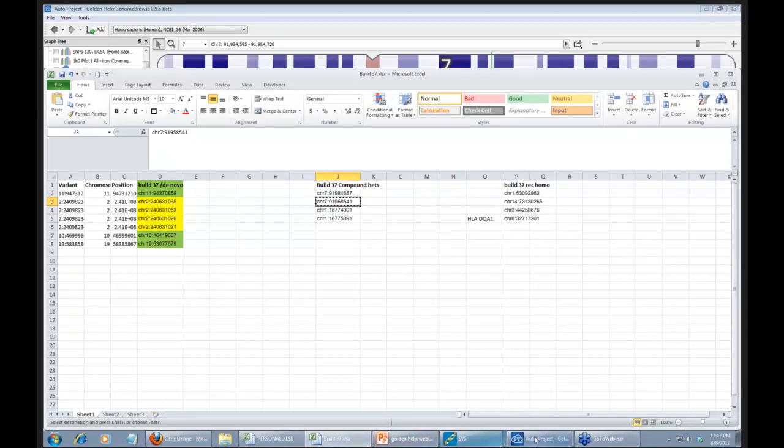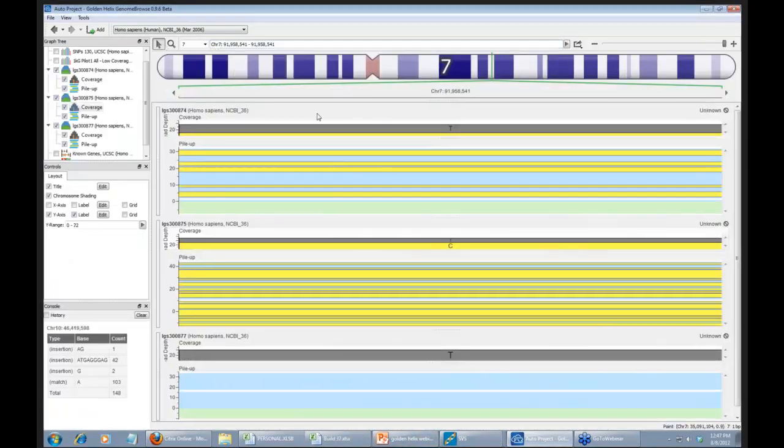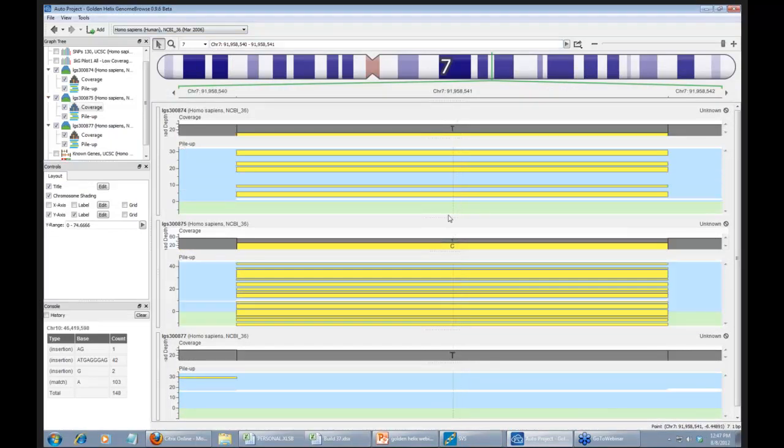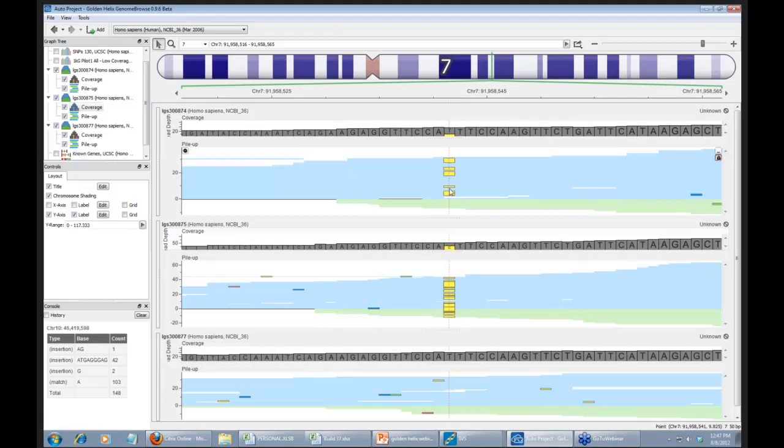If we look at the other polymorphism in this gene, we can see it fits the model that we've described and that the child looks like they are heterozygous. We're really not seeing this allele show up on the sequence that's on the bottom strand, which would make me feel more comfortable about it, but also our coverage for the bottom strand sequence is low.